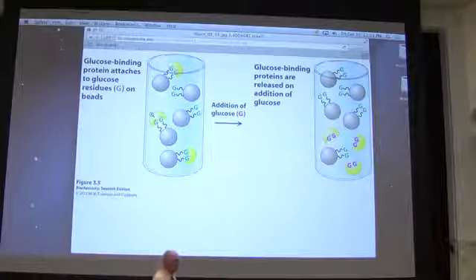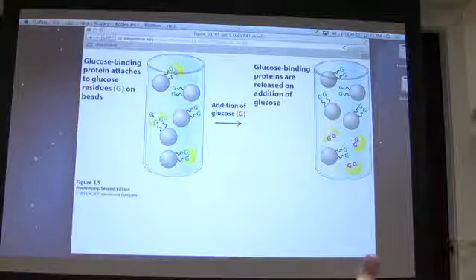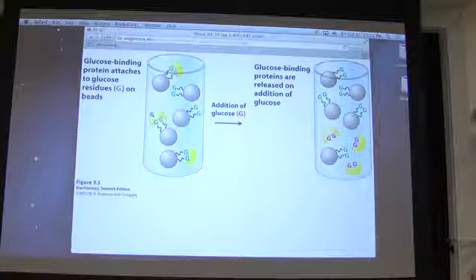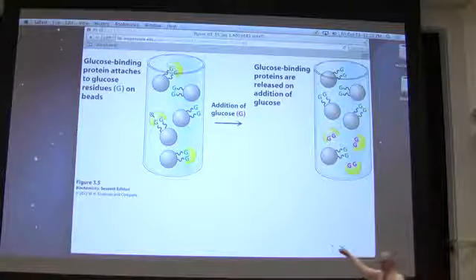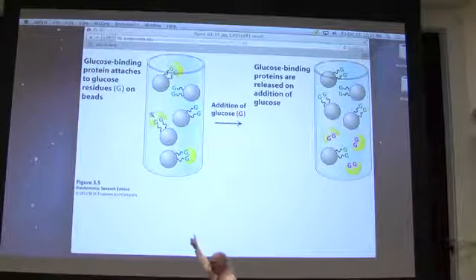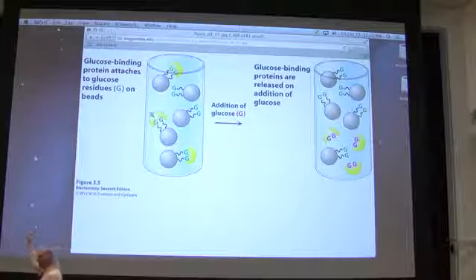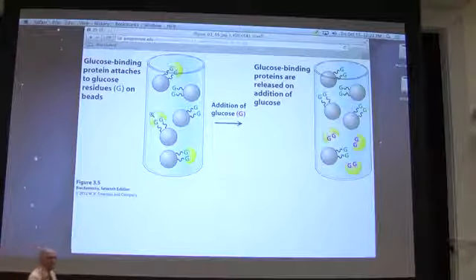That's really useful. Okay? Now, there might be a bunch of proteins that bind ATP, so I might not have it pure, but let's say I know of something that only my protein binds to. It only binds to Kevin Ahernium, right? And we attach Kevin Ahernium to this column, right? What's going to happen? I'm going to purify that one protein that binds to Kevin Ahernium. Okay? You see how powerful a technique this can be? One step, I got my stuff.